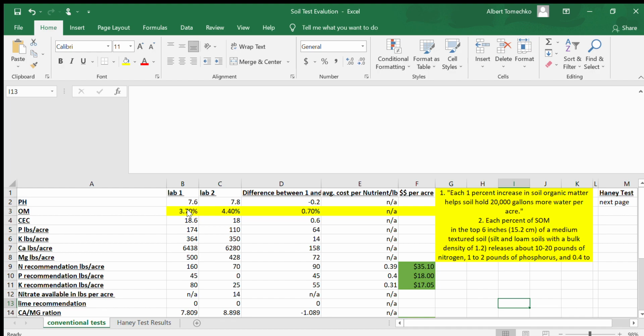Those samples were then broken up and split equally into each baggie. They were then stored in the same conditions, and I repeated the sampling procedure 10 times throughout the sample area, which happened to be my garden in this particular case.